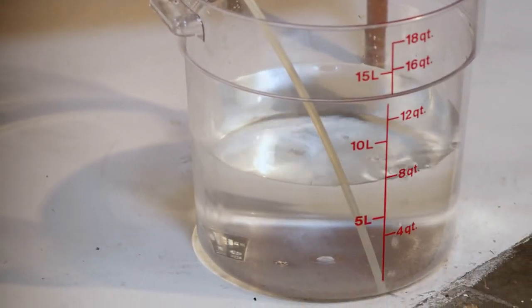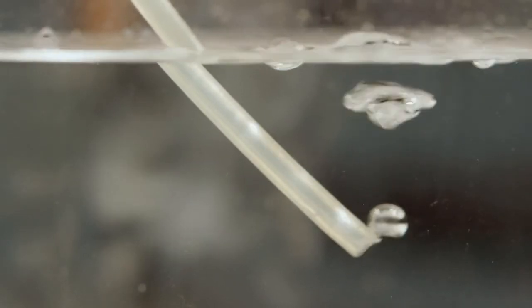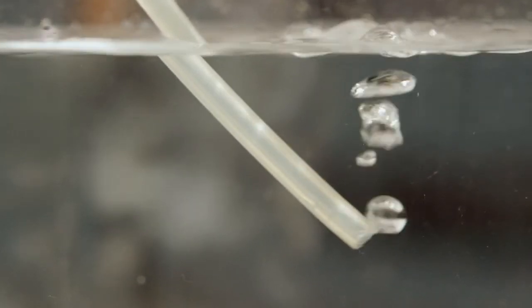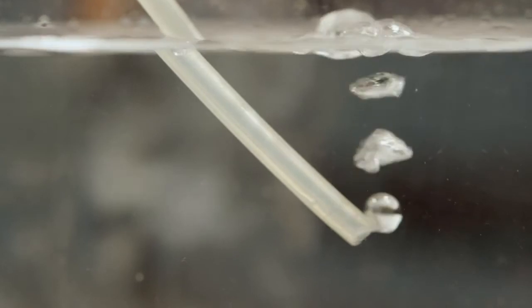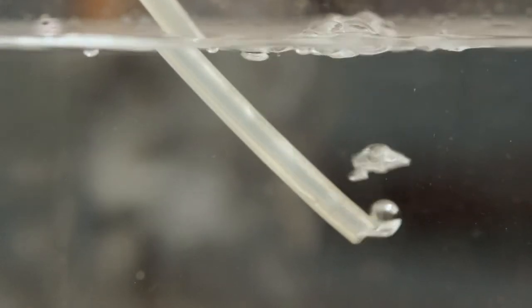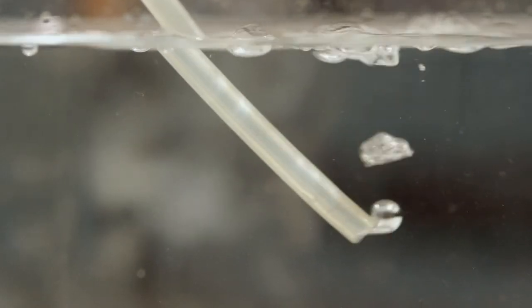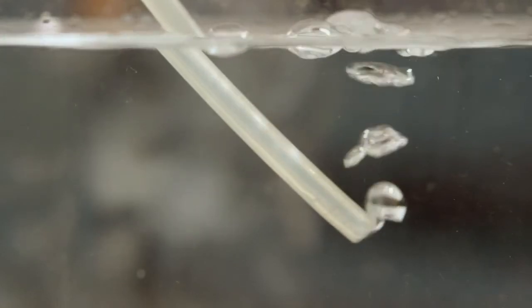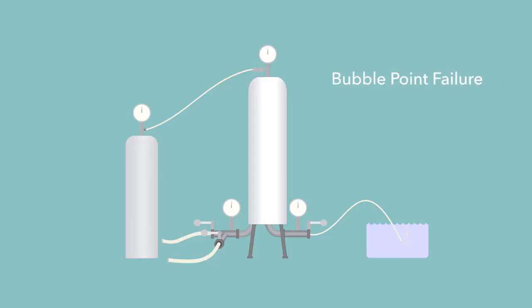When you reach the minimum bubble point value on the regulator, you may see bubble point at this time. It is important to achieve a minimum bubble point value without seeing a bubble point. If bubble point is reached prior to this value, re-rinse the cartridge and perform the procedure again. Continued failure may indicate loss of filter integrity, insufficient wetting, or incorrect seating of the adapter.